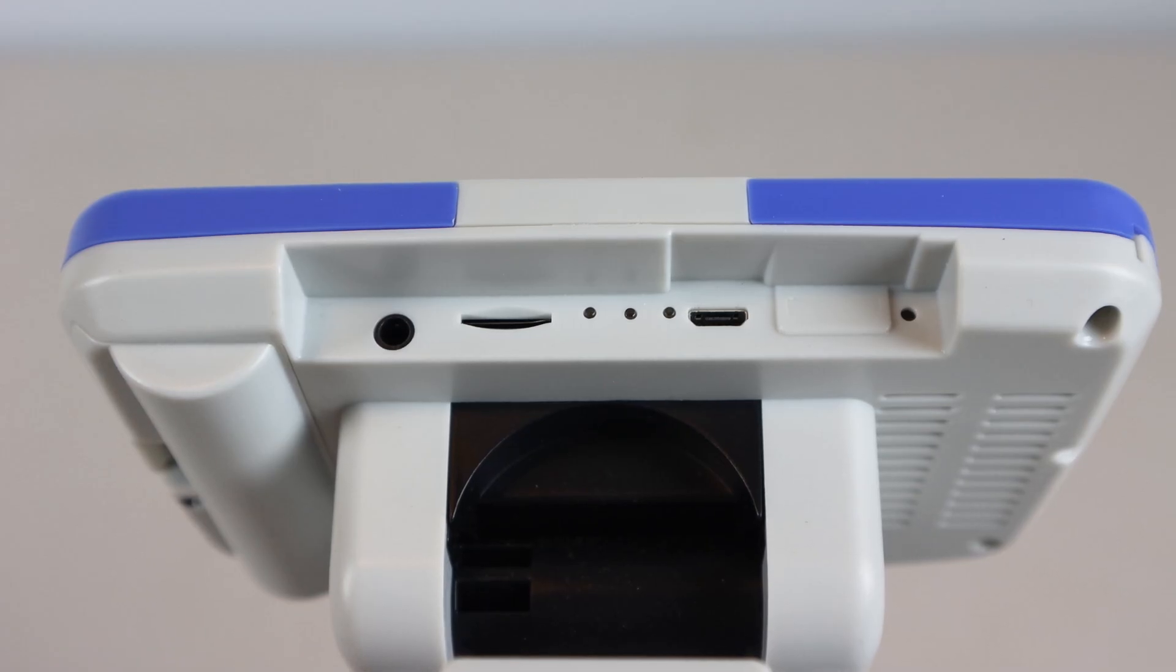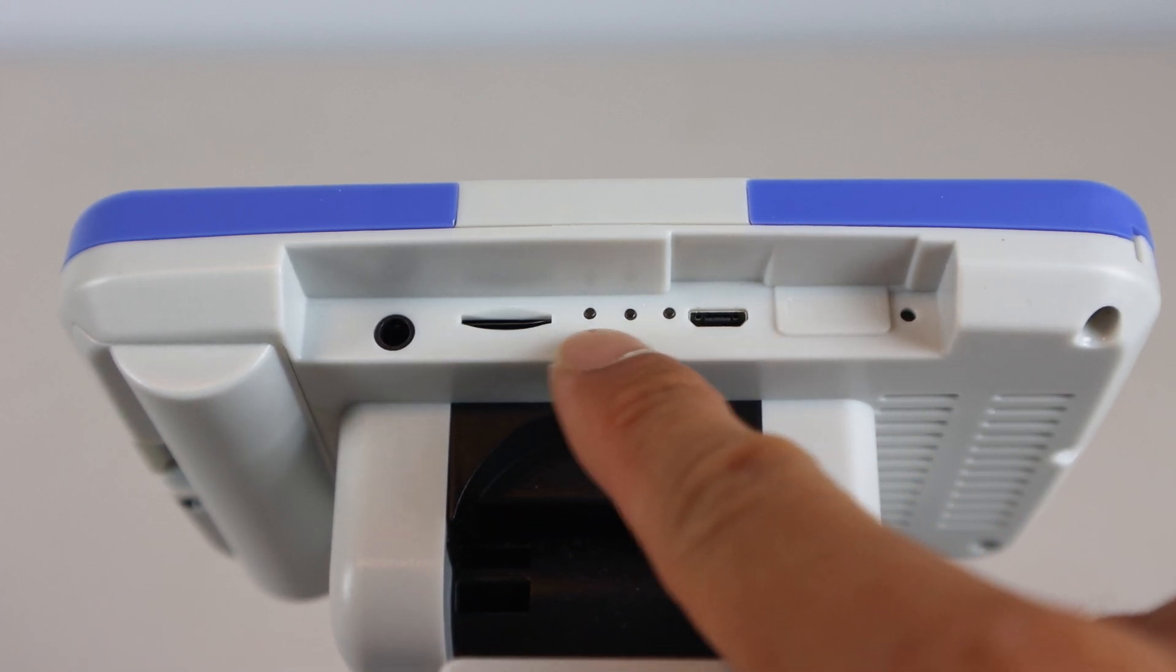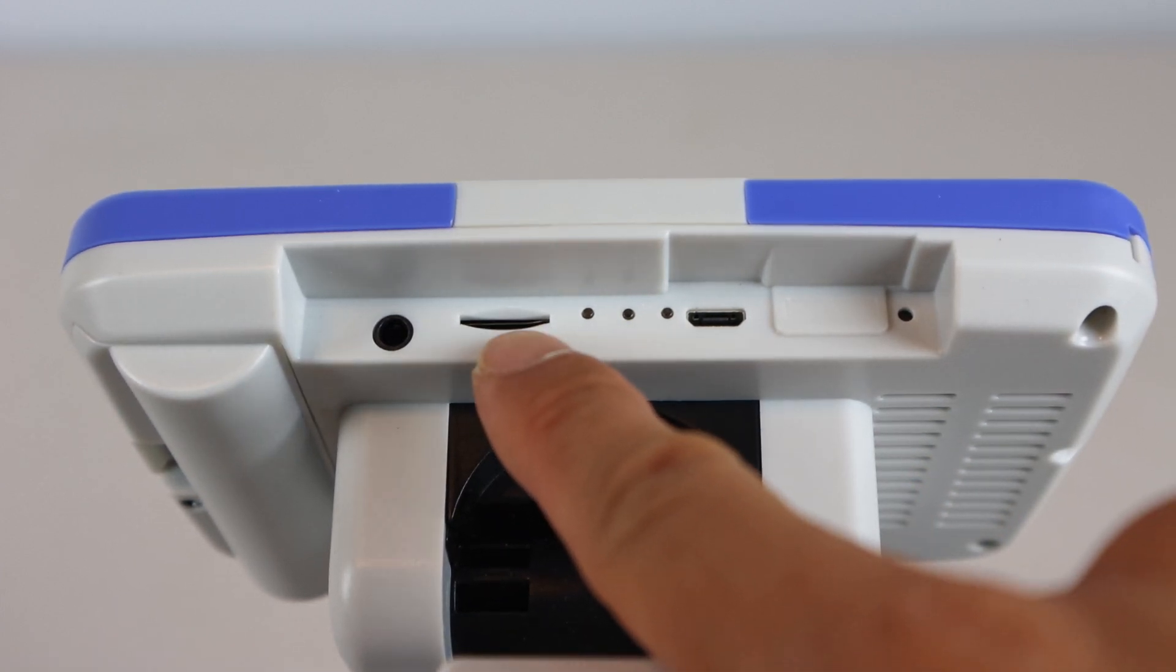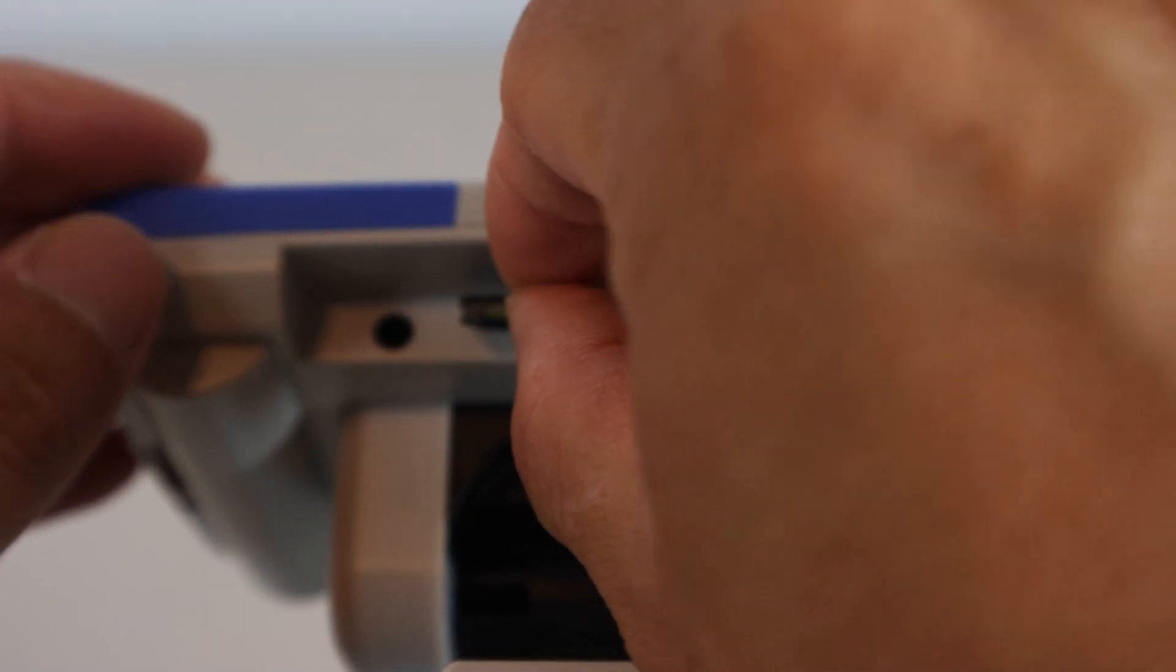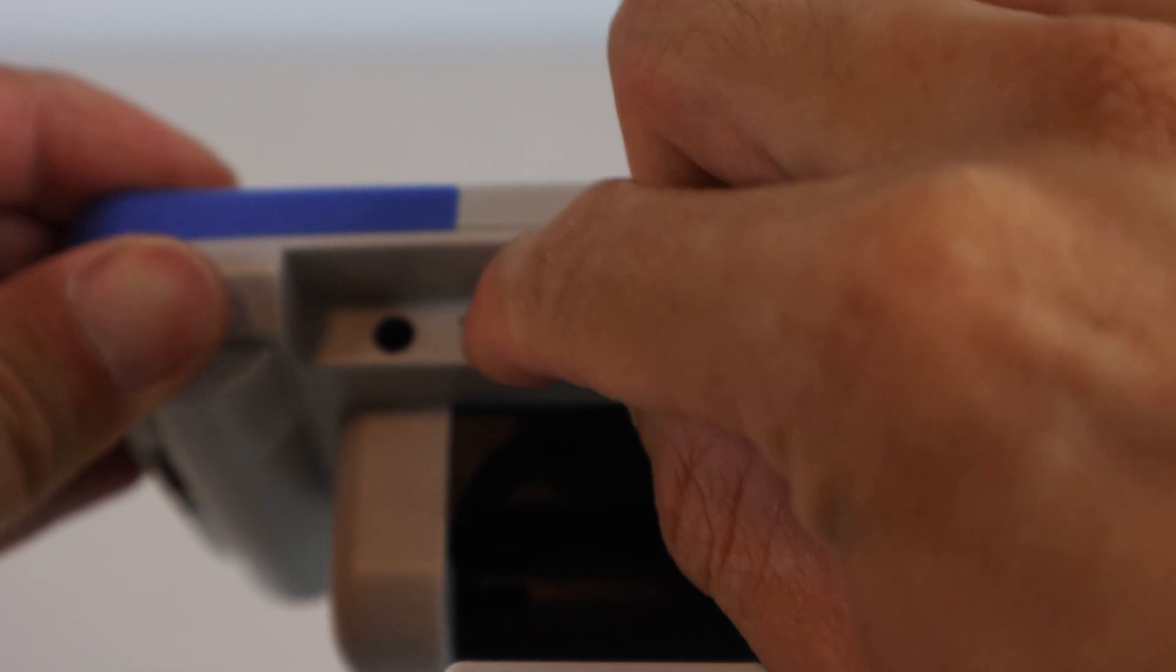Along the top edge of the screen, you have the micro USB charging port, three status LEDs, and a micro SD card slot. The SD card slot accepts up to a 64GB card, though one is not included.